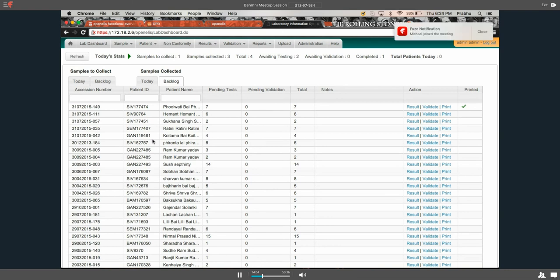And then we have another thing where we put on a lab test that it's ASAP, so it's very important to be done straight away. Those are ones we also need to flag, so that the lab staff, particularly if it's an inpatient where they go and collect the sample, know the sample collection needs to be high priority.